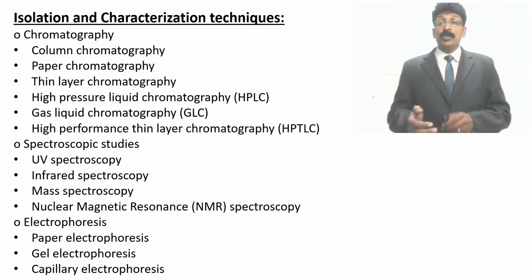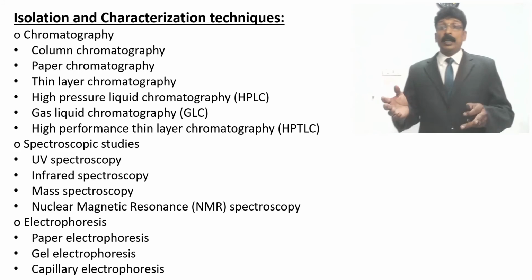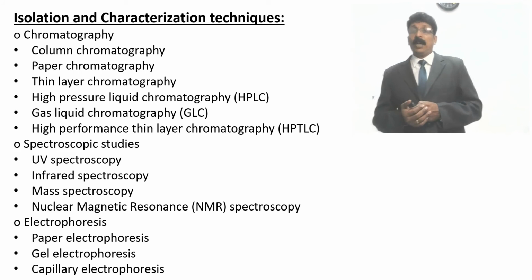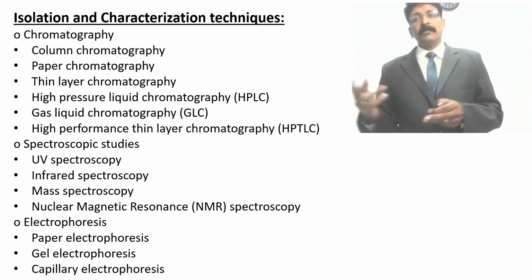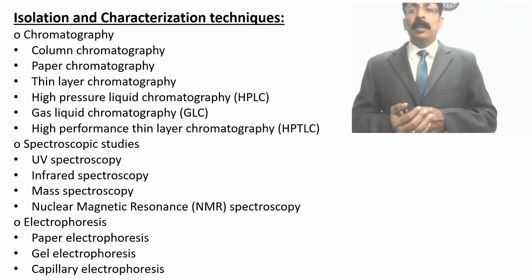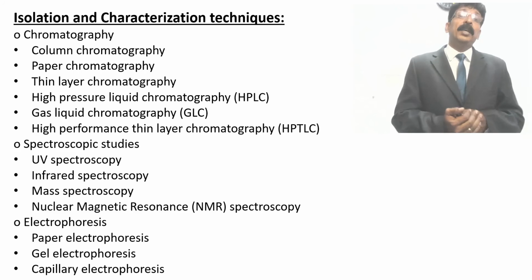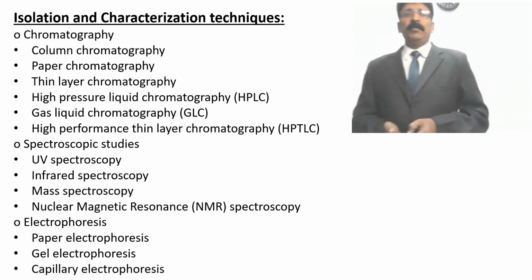We will see how electrophoresis is applicable in DNA fingerprinting, how various forensic departments perform DNA analysis, as you may have seen in criminology. We will also briefly discuss how it is applicable to herbal drug technology and isolation of compounds from natural sources.